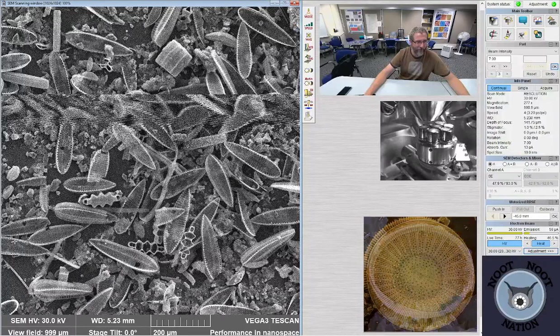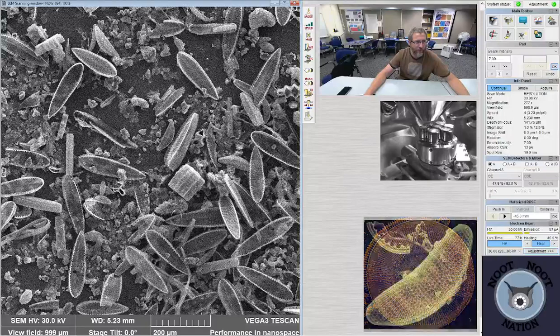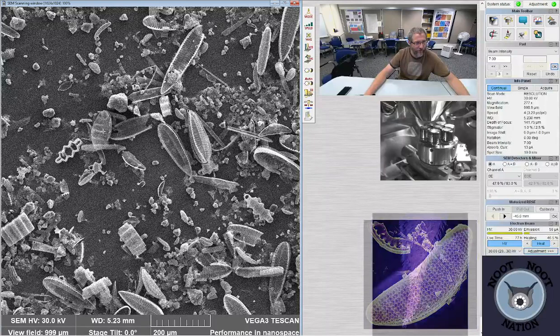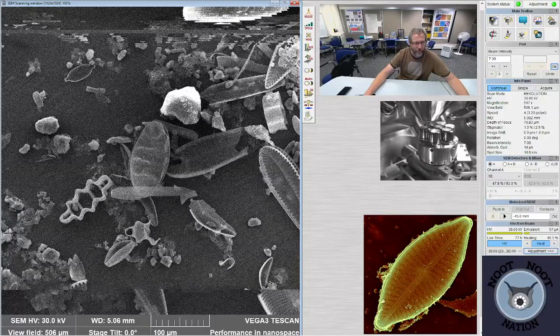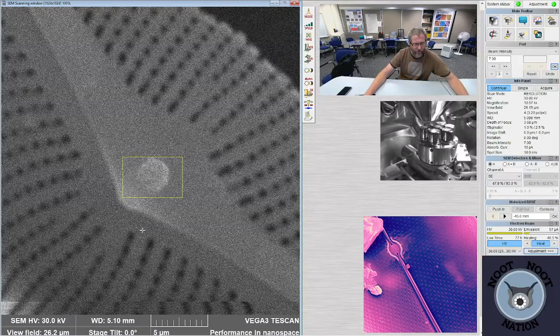These little guys here, those are actually really cool. Those are Terpsinoe, and that's also a girdle view version of Terpsinoe right there, I think. And you can see this sample is totally dominated by these Cymbella. It's just mostly Cymbella, these leaf-shaped things. And then there's another Cymbella, different genus, a different species. That one's wiggly. Used to be Campylodiscus, got moved. And this is a giant Cymbella. That's Mexicana. Bet you weren't expecting that.